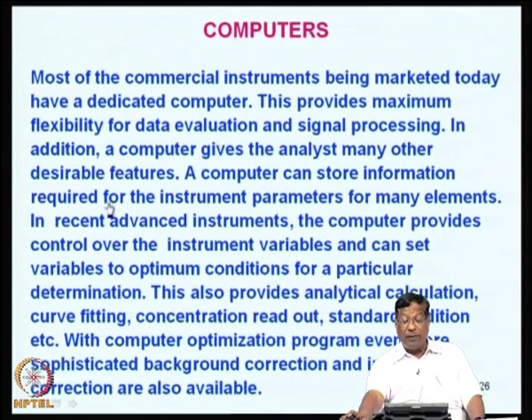Therefore, most of the commercial instruments being marketed today have a dedicated computer which provides maximum flexibility for data evaluation and signal processing. In addition, the computer gives the analyst many other desirable features such as storing of information required for the instrument parameters for many elements.